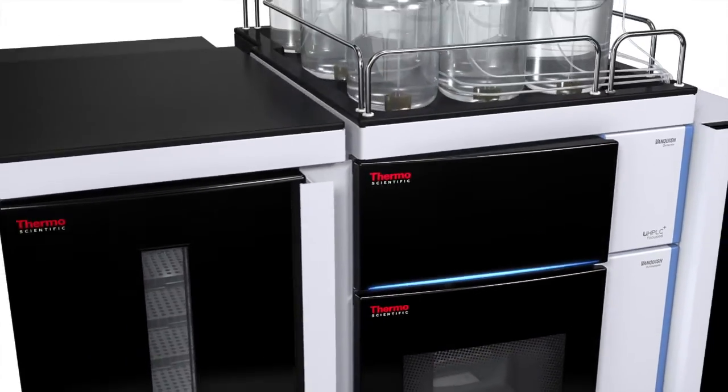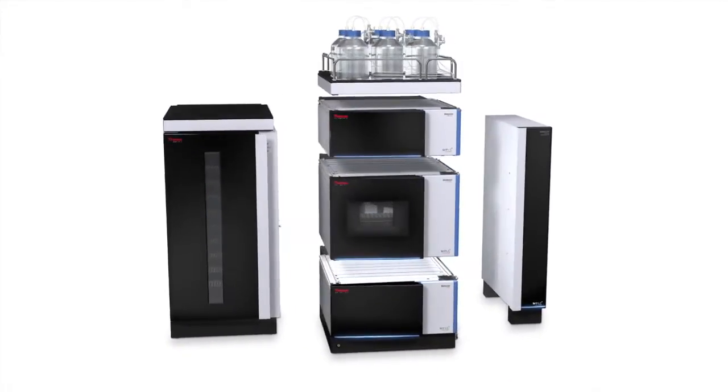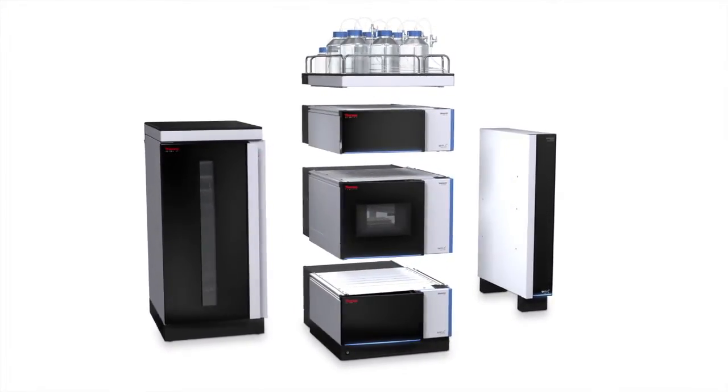We want that challenge to be your science, not your instrument. Our mission is to let you find better answers, more answers, and get them faster.